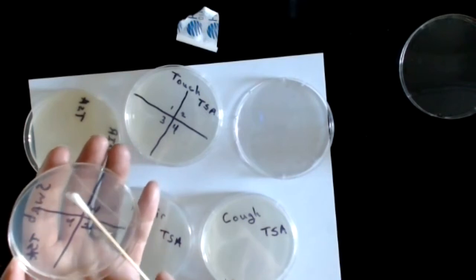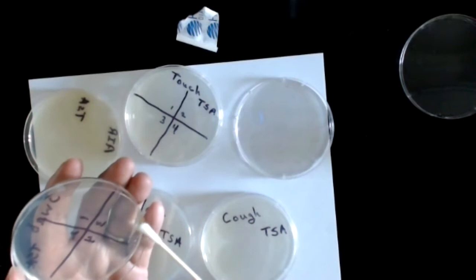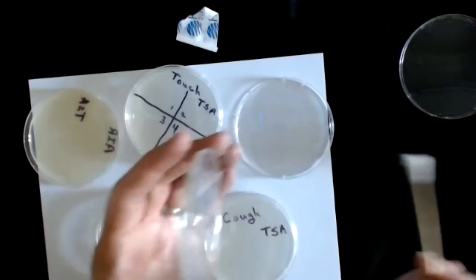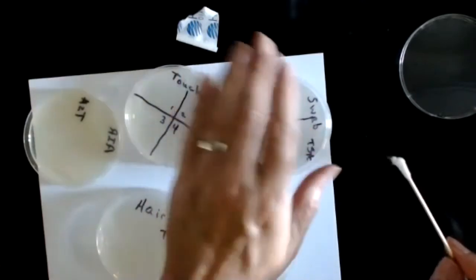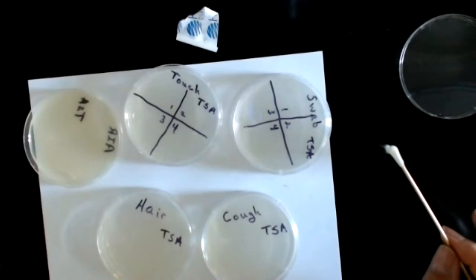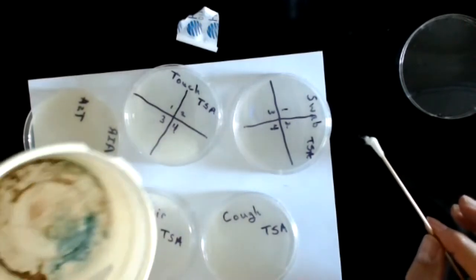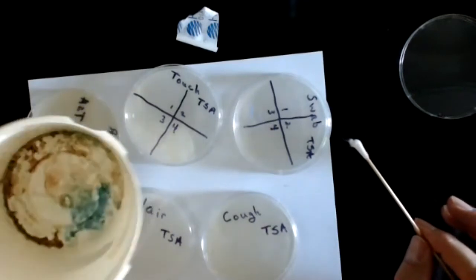Back and forth. When I'm done rubbing, you don't want to push down hard because the agar is soft. It's like Jell-O. Once I'm done, I pull the swab out of the way. I put the bottom of the plate upside down back inside the top so it's no longer exposed to the air. And then I will find a disposal container, like this incredibly clean one right here.